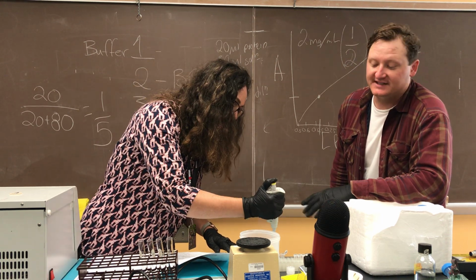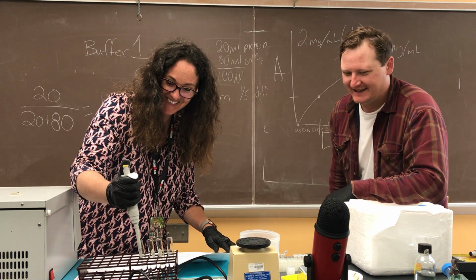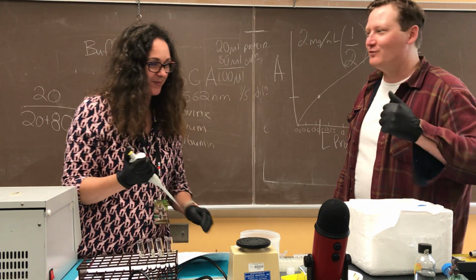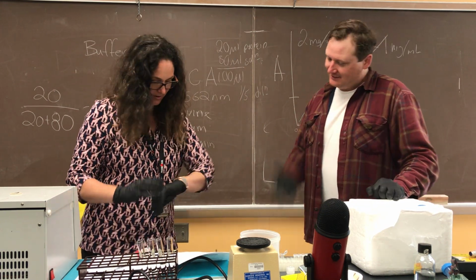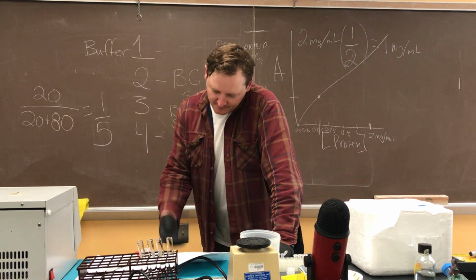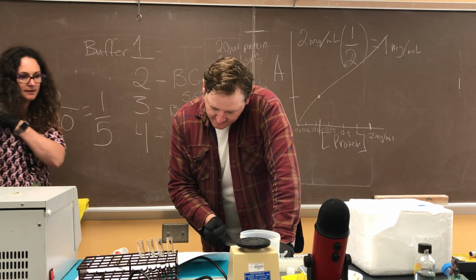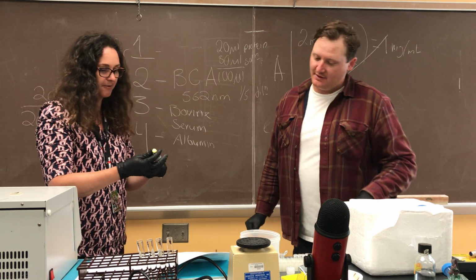Once again, these tips would be changed out in a normal lab. Yeah, definitely. Which is why the tip boxes are so handy. You can really rapidly swap tips out once you get a grip on it. Okay, how are we doing? We've got 2 minutes left. Perfect. I would say that we're fine to just keep moving through it, yeah.